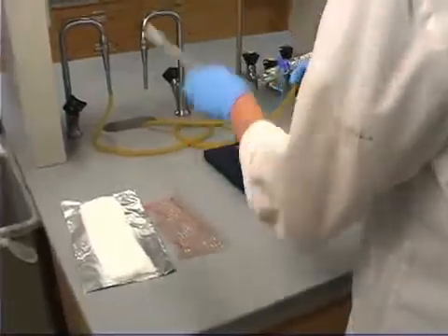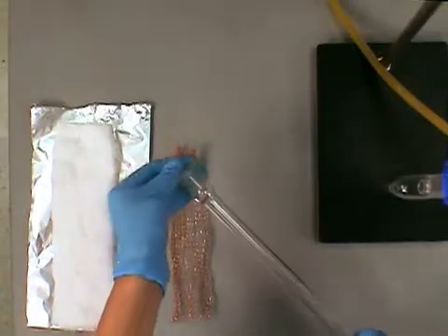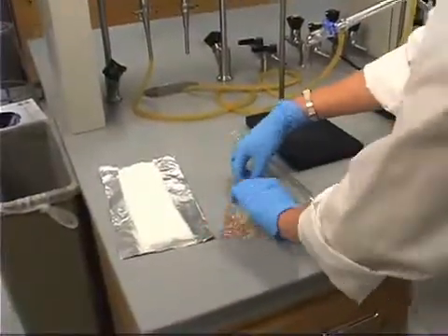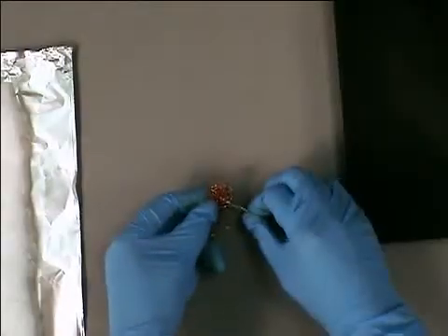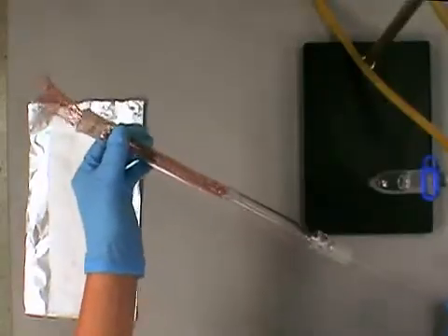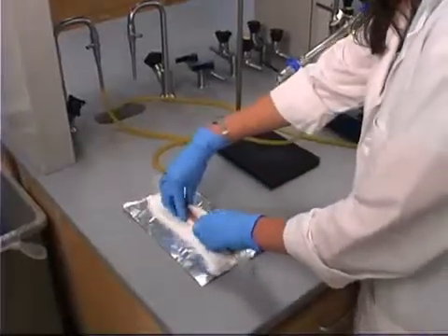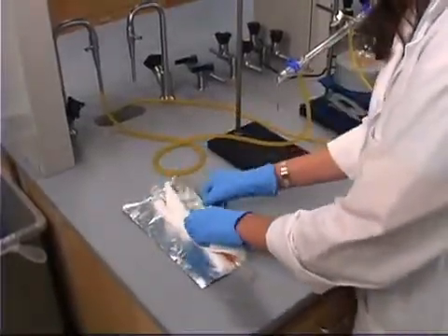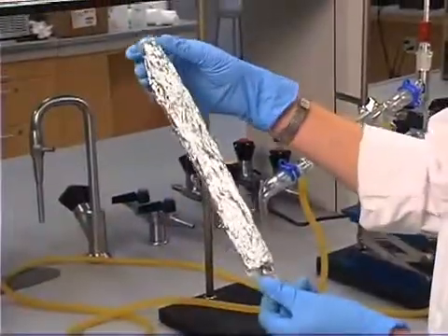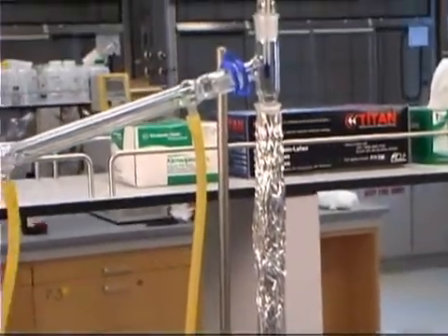I will now demonstrate the assembly of the fractionating column. Insert a wire through a column. Fold a piece of copper mesh. Unhook it on the wire. Now gently pull the wire through. To better insulate your fractionating column, wrap it in cotton with a layer of foil on the outside. The fractionating column that we just assembled is inserted between the round bottom flask and the distillation adapter.